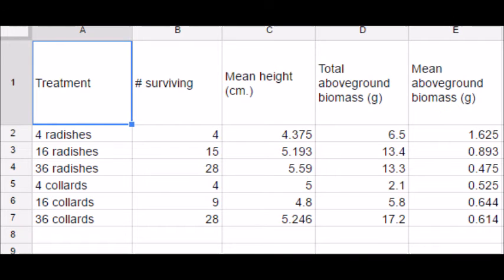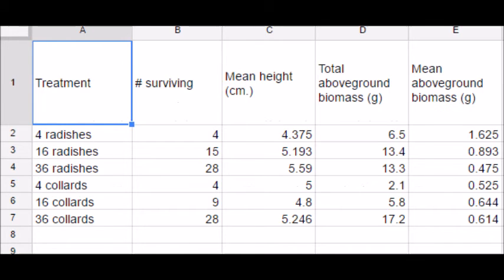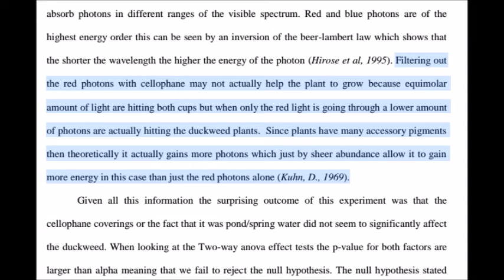Most scientists prefer a notebook, usually a computation book with small grids. A composition notebook will do. And the general format follows something like this. We would include all methods or calculations or formulas used for calculation, the experimental conditions like the concentration of solutions, exact temperature, tabulated data, and comments concerning various steps of the experiment, and definitely descriptions of possible sources of error. At times in universities, you'll be expected to calculate all of the stock solutions for yourselves.